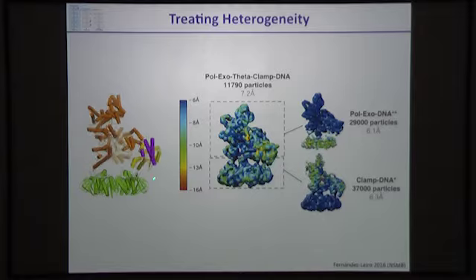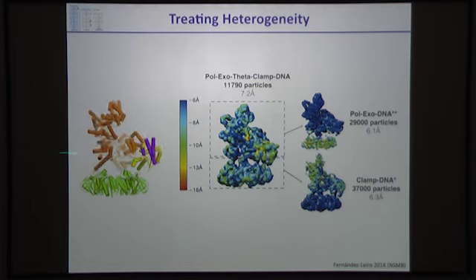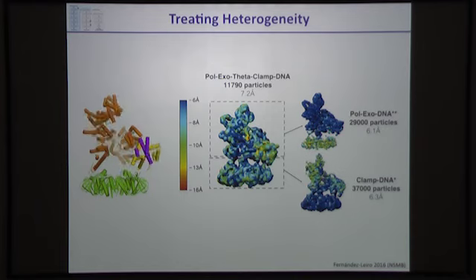What I've done is, from the reconstruction at 7.2 angstrom with 11,000 particles, actually when I did this it was a bit higher number, I classified it into 10 different classes, then fit a model to each of those classes, aligned to one of the proteins, and then played the movie through them so you can see the range of movement. So what you can do now to account for this movement is divide, like I just told you, your map into different domains and refine the angles individually. So you can improve the resolution from 7 to 6 for these two regions.